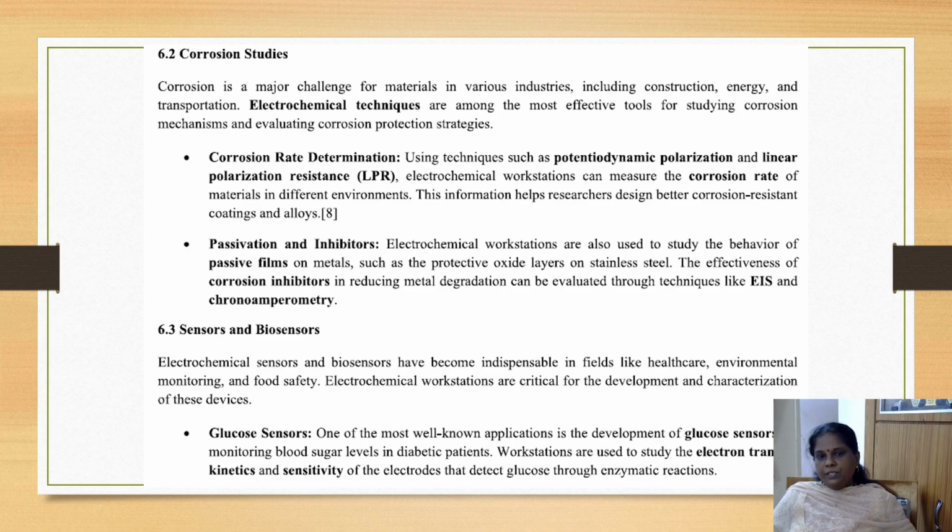The third application is sensors and biosensors. Electrochemical sensors and biosensors have become indispensable in the fields of healthcare, environmental monitoring, food safety, etc. So, electrochemical workstations are critical for the development and characterization of these devices. First, let us see the glucose sensor, which is mainly used to monitor blood sugar level in diabetic patients. Workstations are used to study the electron transfer rate, kinetics and sensitivity of the electrodes that detect glucose through enzymatic reactions.